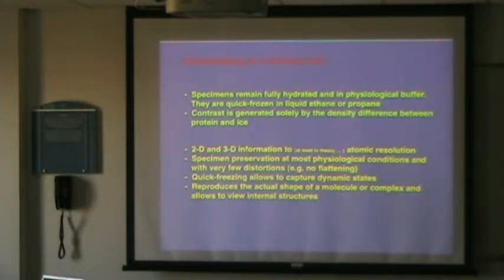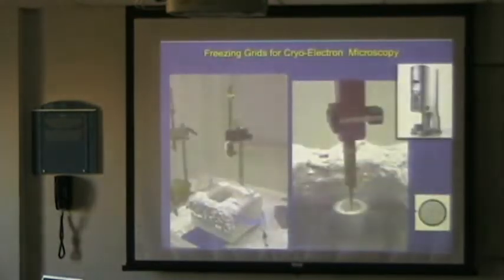And of course, the biggest advantage is you don't really look at the cast, which may be wrong in places where the stain doesn't reach, and so you actually reproduce the real protein shape as it is. Problem: low contrast, and it sometimes requires fairly expensive equipment.